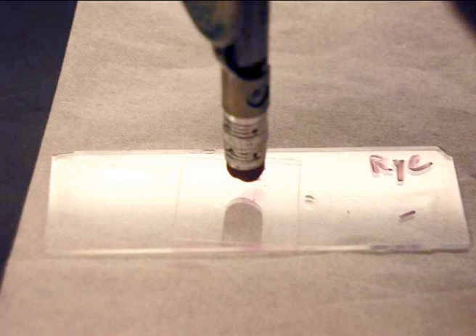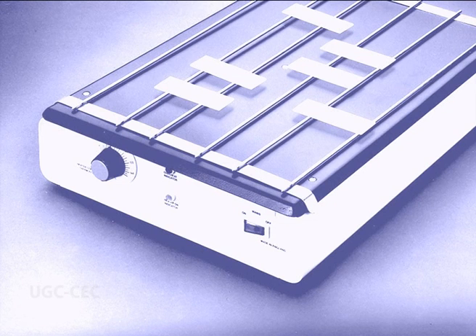Gently tap the cover slip with the rubber end of a pencil or the wooden end of a dissecting needle to spread the material. Care must be taken not to move the cover slip. Place the slide over a steam bath or warm it over a hot plate until the stain at the cover slip edges begins to show signs of drying off.